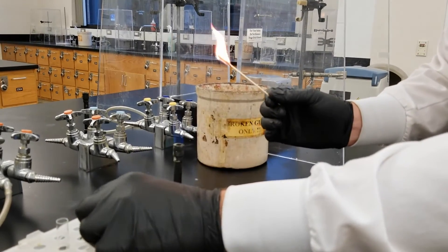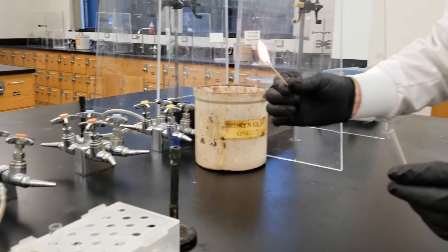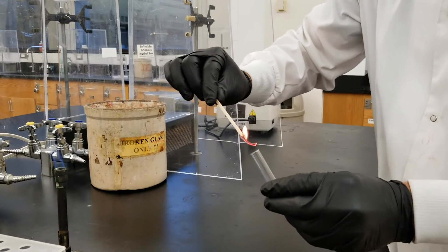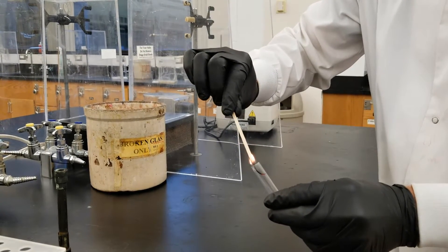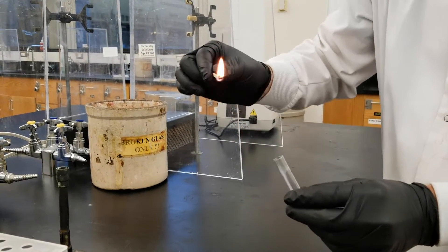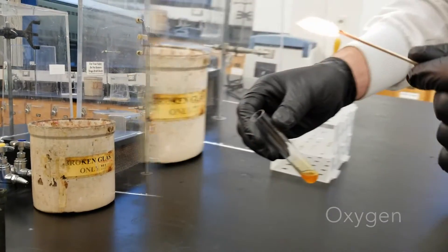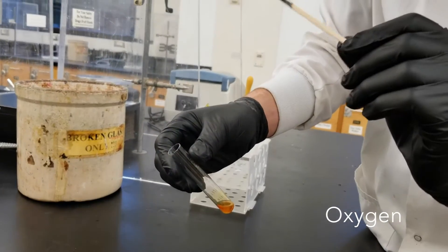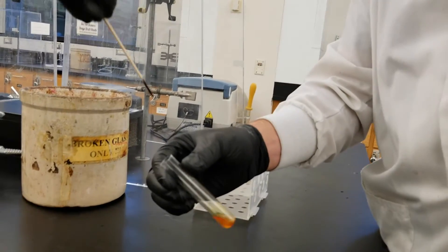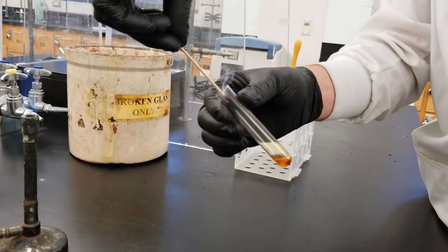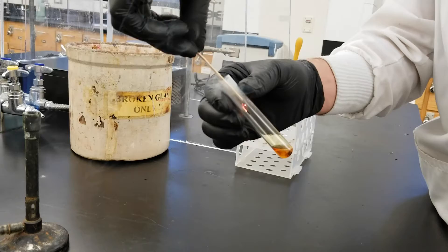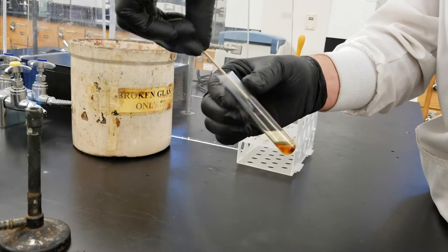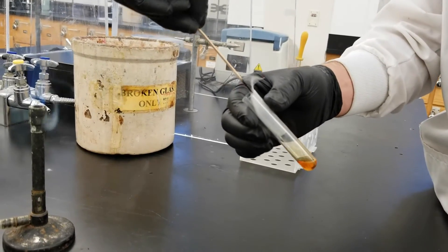In each case you'll tilt your test tube containing the unidentified gas and insert the glowing or burning end of your splint into the test tube. The table in your lab manual will help you identify the chemical based on what you observe. A glowing splint will reignite when exposed to oxygen gas because oxygen supports combustion. Occasionally you will hear a small pop as the splint reignites but this is distinct from the burning splint test for hydrogen.